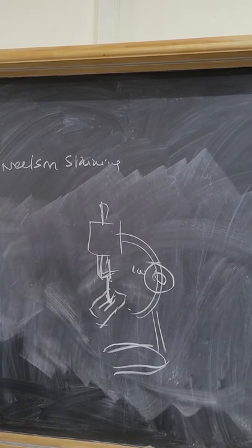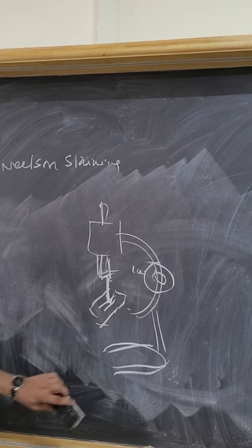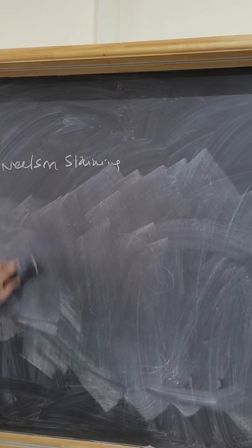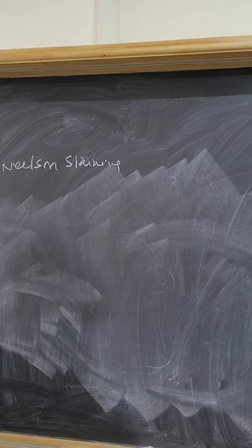Once you start seeing something, with fine adjustment, you adjust the focus. Once you see the bacilli, the background should be blue in color.